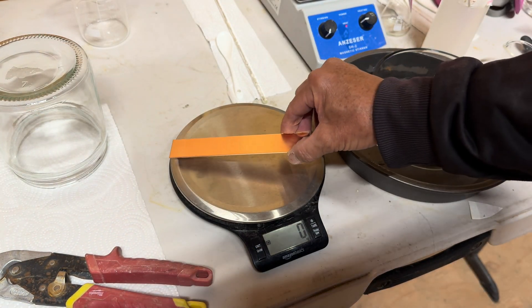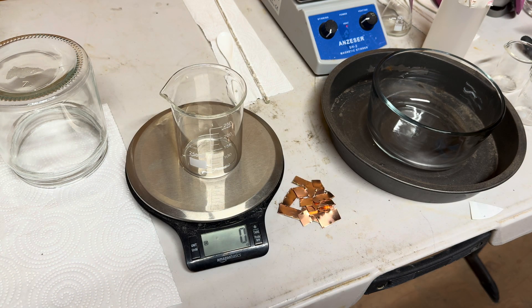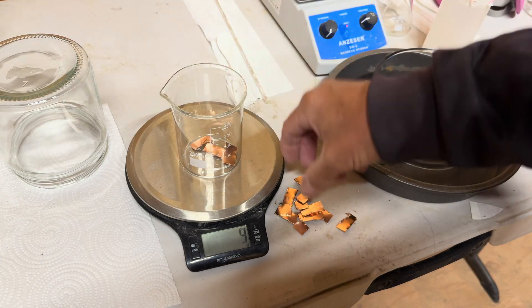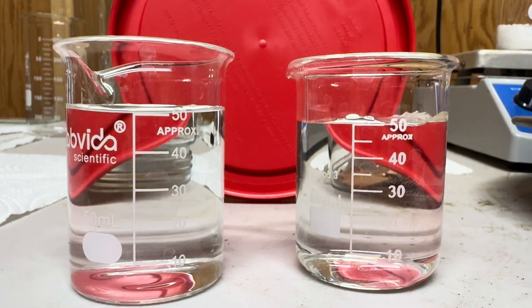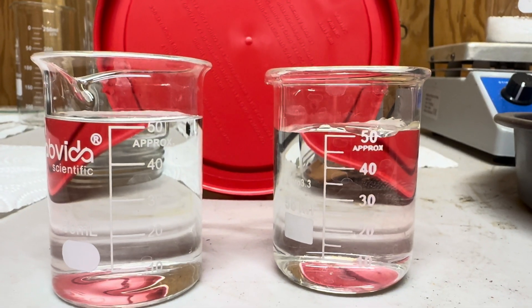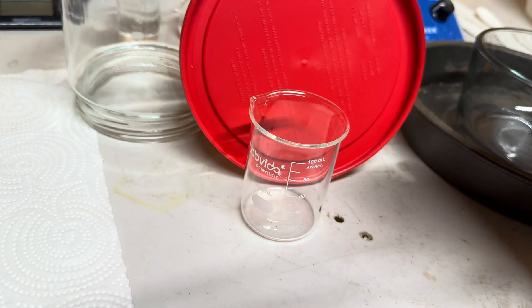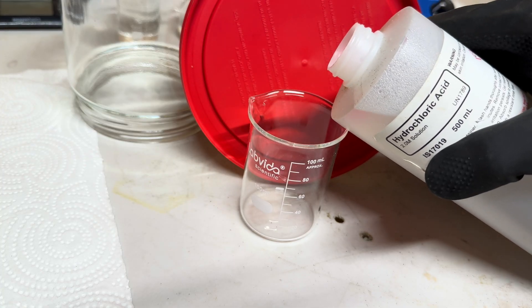Next, let's get at least 32 grams of copper and prepare it for our project. We have two small beakers each holding 50 milliliters of distilled water. We will also need 100 milliliters of hydrochloric acid.